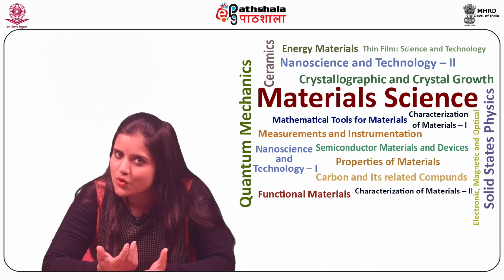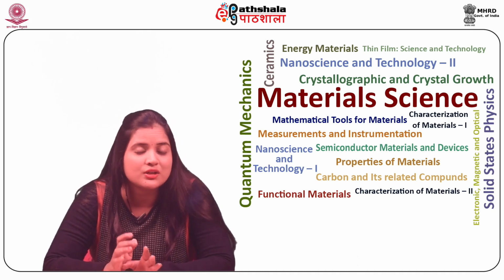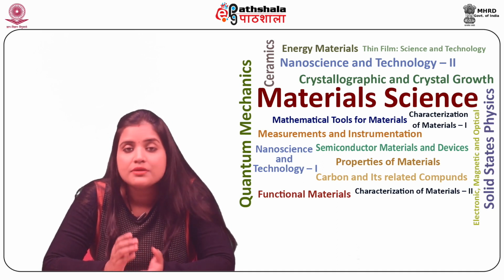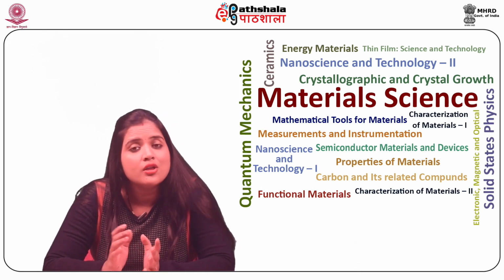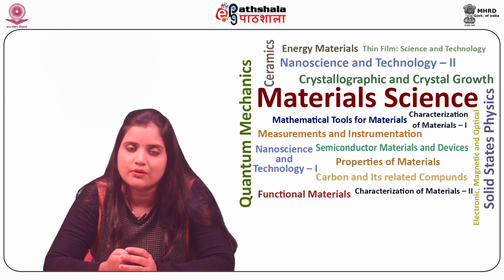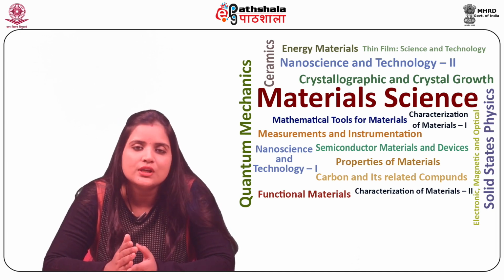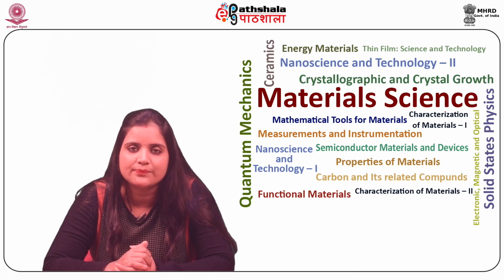Coming on to the disadvantages of STM, firstly, the tip selection is highly challenging. Then, the scan process is time consuming. Another disadvantage is that smaller images are produced. Also, it is not suitable to study solid-solid or liquid-liquid interfaces.